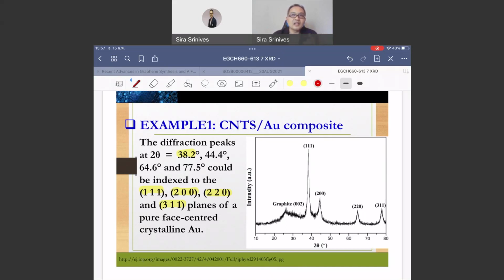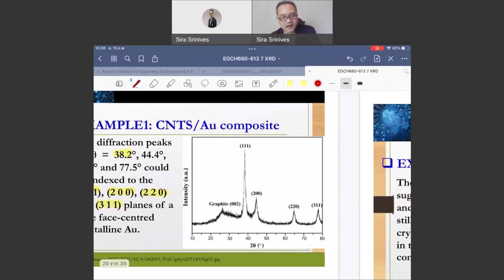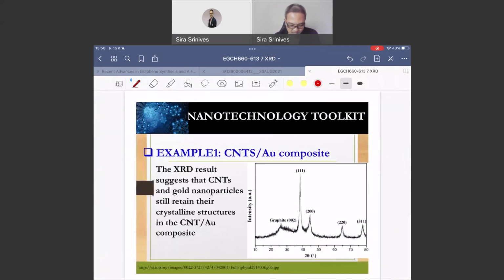So it's like the temperature that you use for the annealing system, to anneal the material, causes different structures in the crystal structure. And it appears on the SEM, on the TEM, and on the XRD, you see different phases happen too. So that's the kind of story that you would like to tell, not drawing everything out of a single analytical result, right? I'm sure you understand.